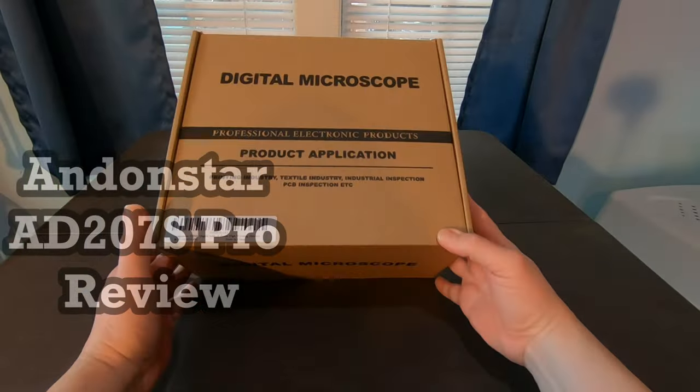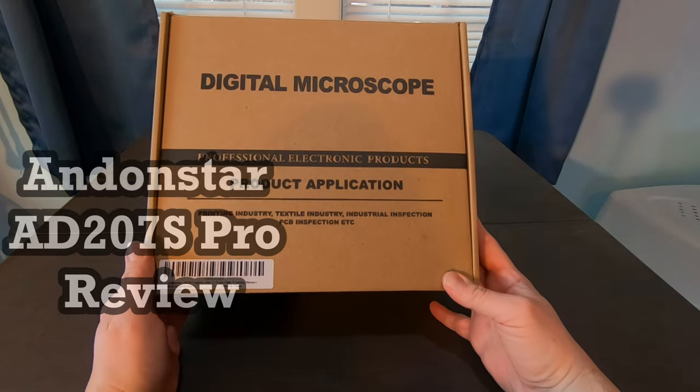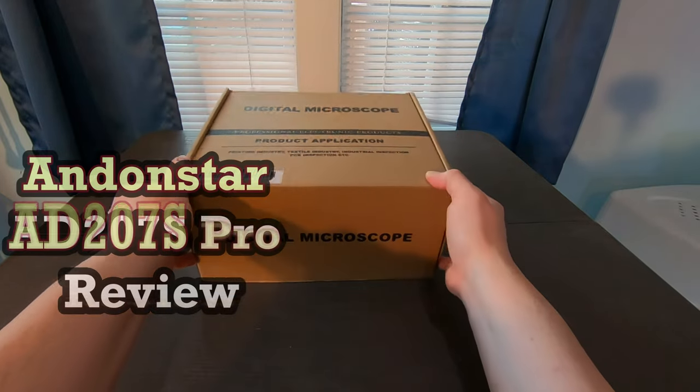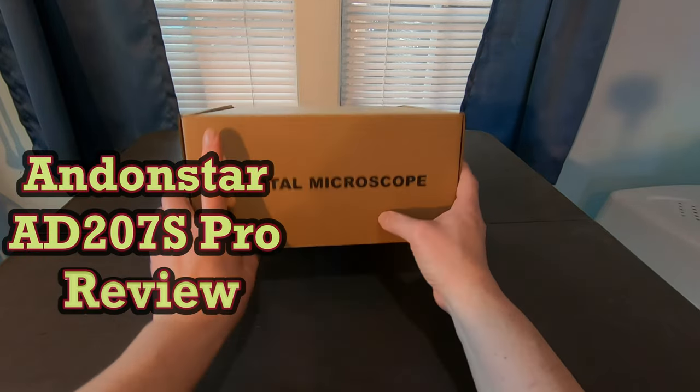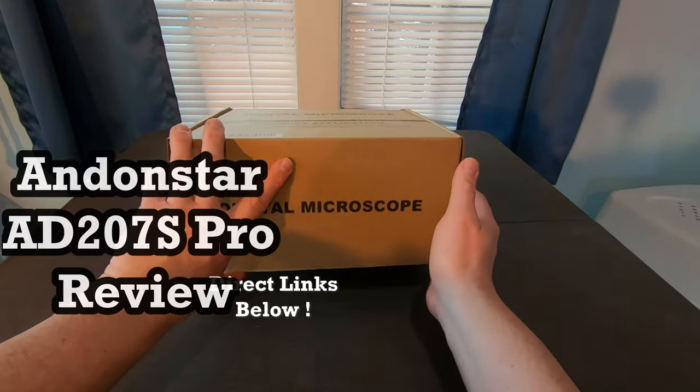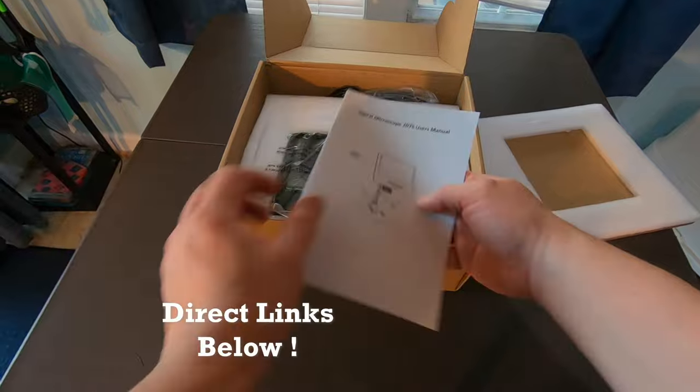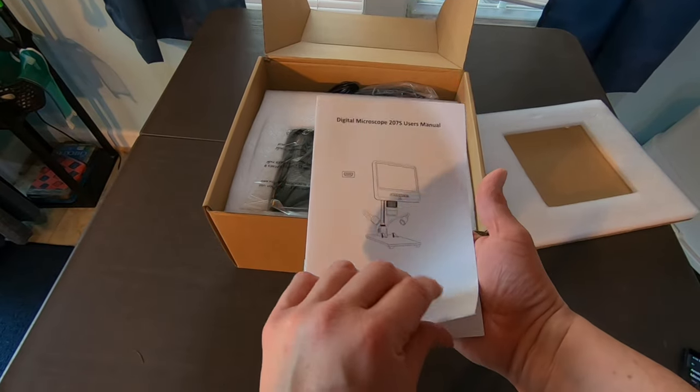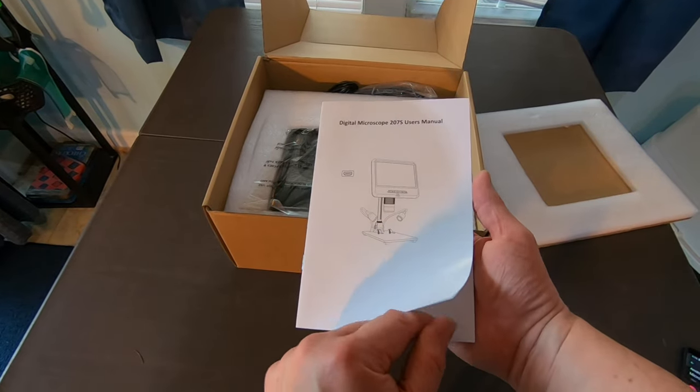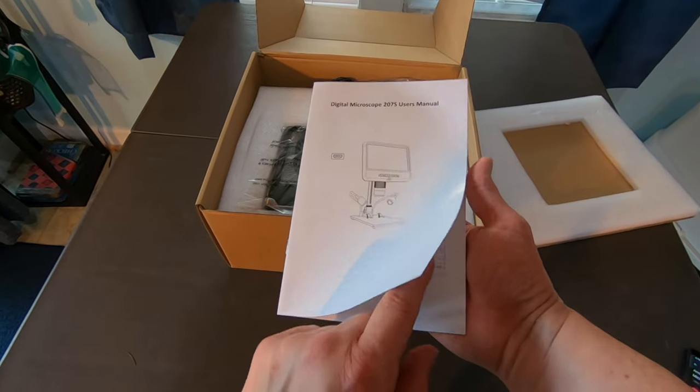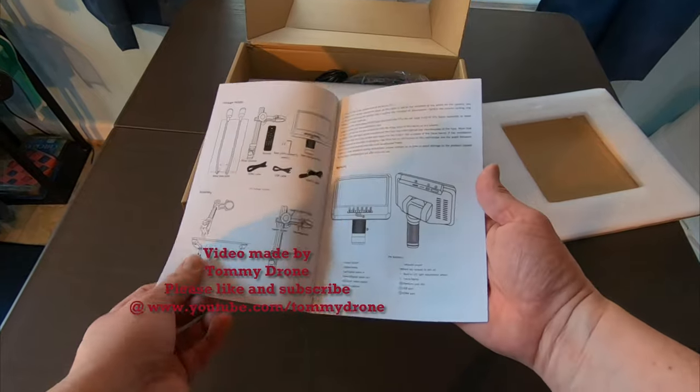Hey everyone, Tommy Jordan here. This is the Addon Star Digital Microscope. So looking down, we have here our instructions for the Digital Microscope 207S. Here's our user manual.